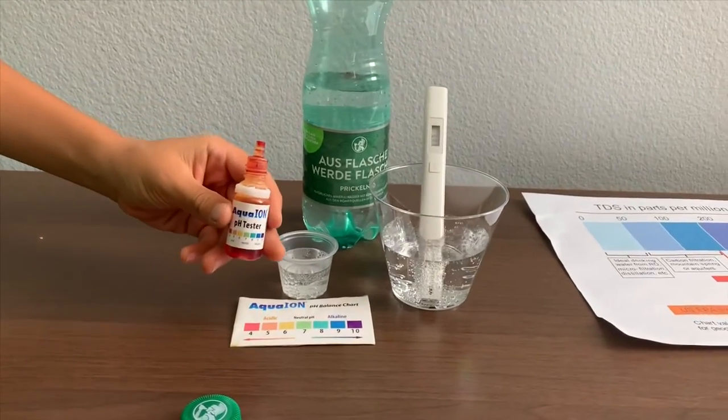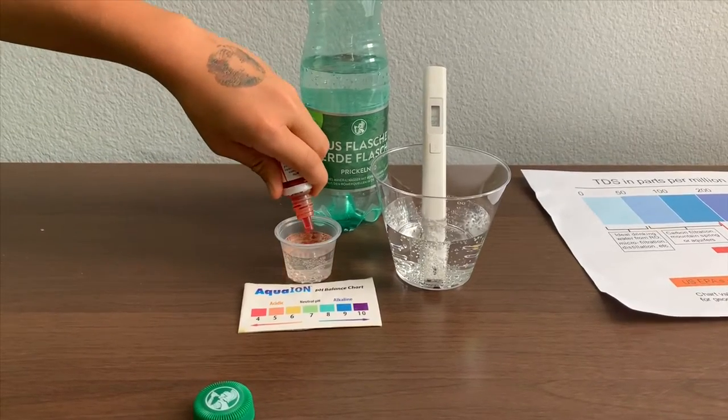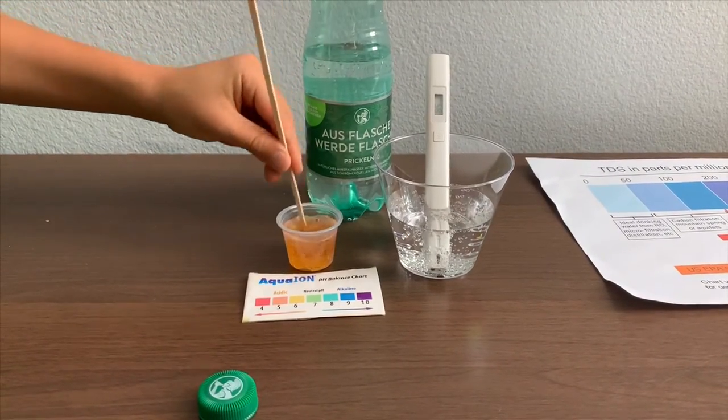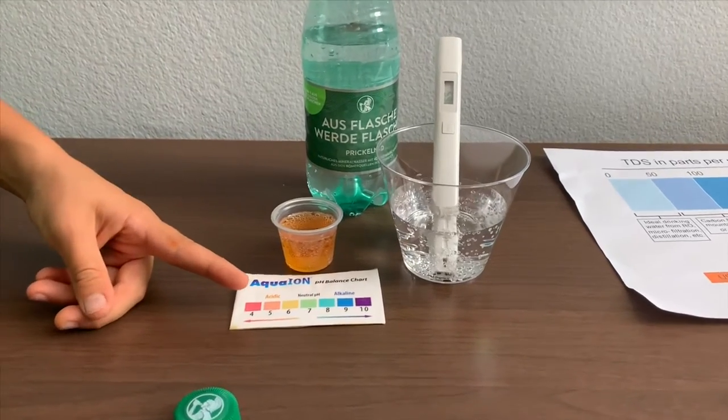If you want to buy this pH Tester, check the link down below. Let's stir it for the result. I give this a 5.5 — this is acidic.